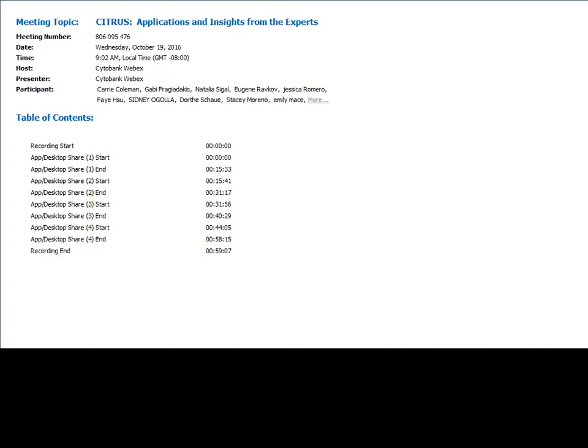To Jeff's question originally about why did I create Citrus and why do that? As an incoming graduate student, I was really excited to learn about the power of single-cell experiments, particularly with respect to identifying these cellular subpopulations that could act as strong biomarkers for disease progression or clinical outcomes, drug response, things like that.